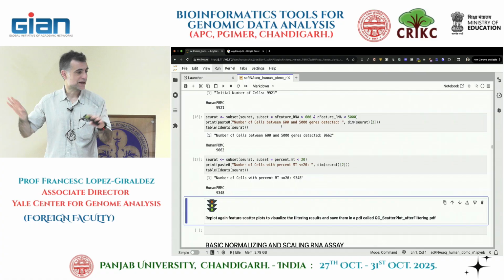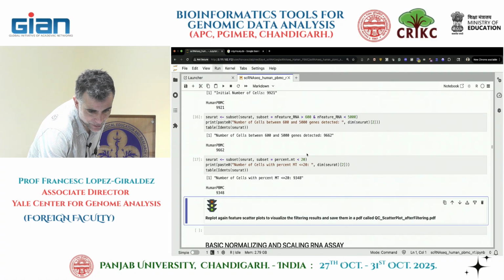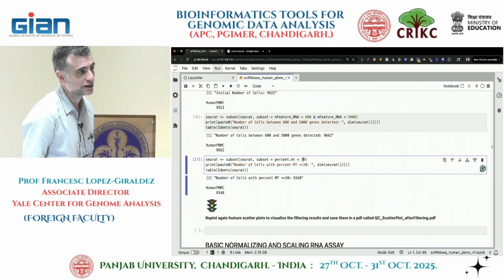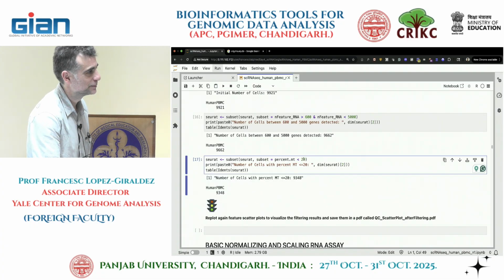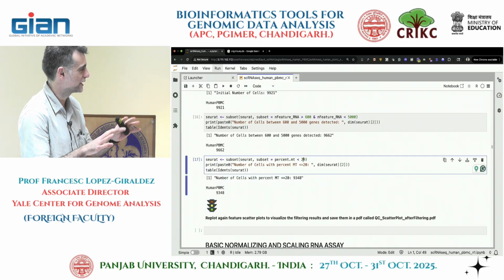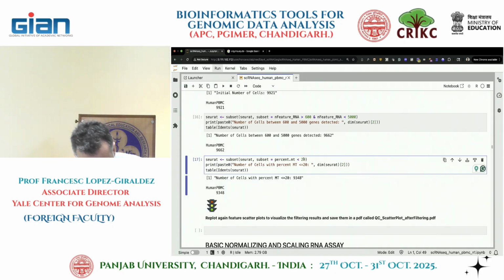They're suggesting that we should go down to 10. It's up to you. But the plots from now on, if we have different numbers, will be slightly different. So you know how to do the next exercise, right? And how to save the plot into a PDF?